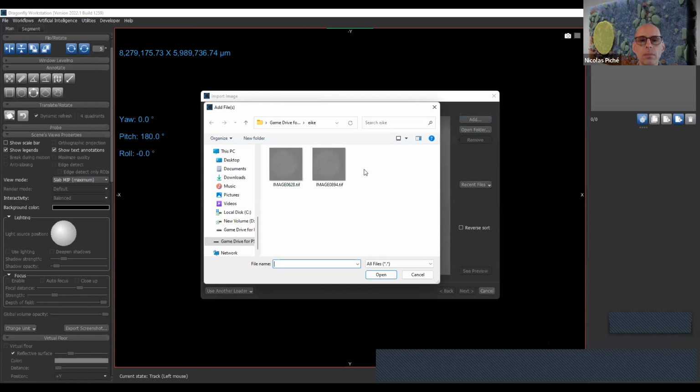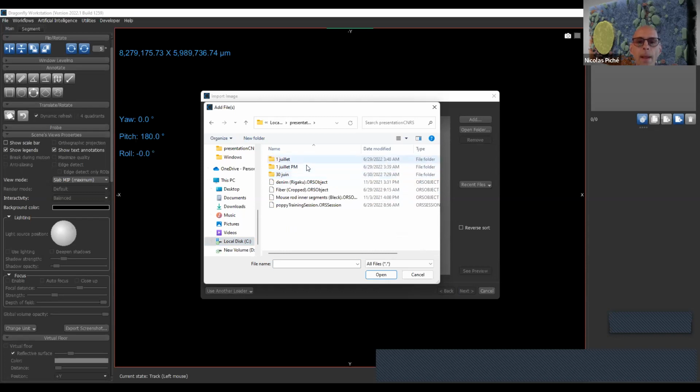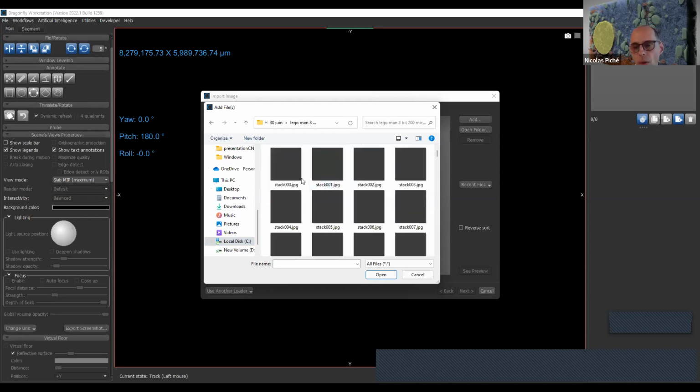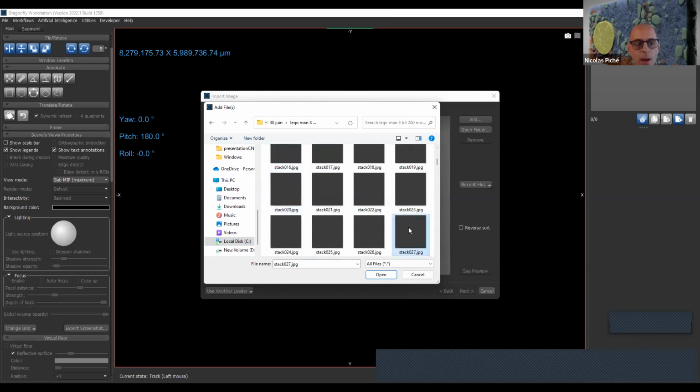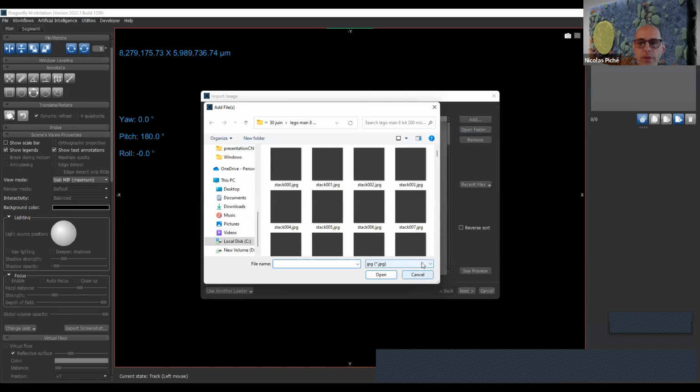Sorry about that. I should not show you all of that. Okay, so here I will load the 8-bit data, oh, they were stored in JPEG, funny. Okay, I will load our data set from Ixon. Okay, it's a JPEG. We support, as you see, multiple formats.